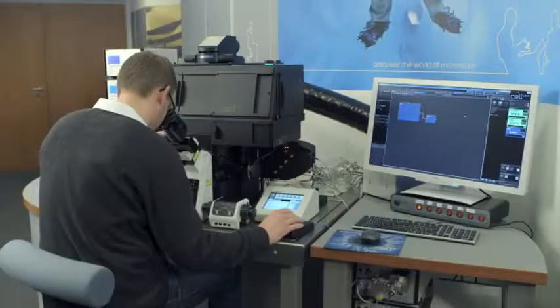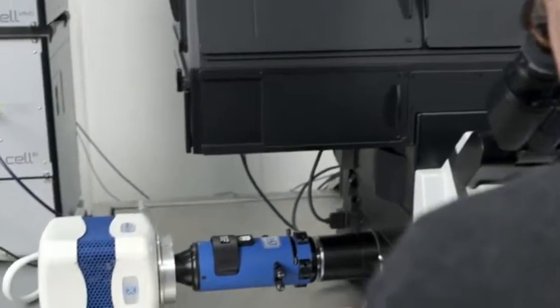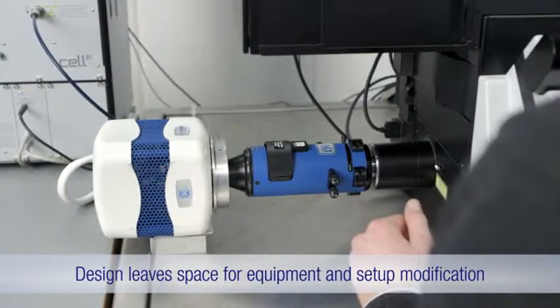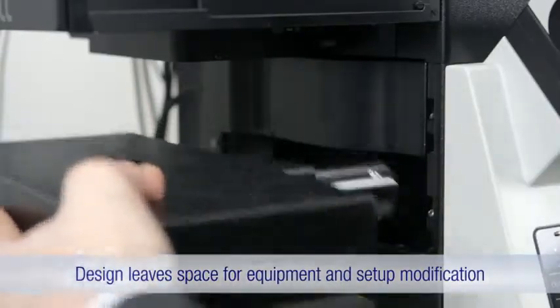Ideal for a range of live cell imaging applications, Cell Vivo's design leaves room outside the enclosure for external components, allowing you to truly capitalize on the freedom of the open-source IX3 range, exchanging optical modules from the infinite light path.